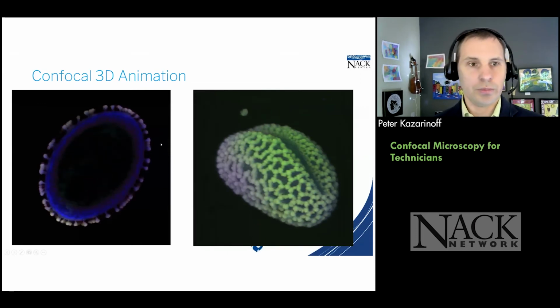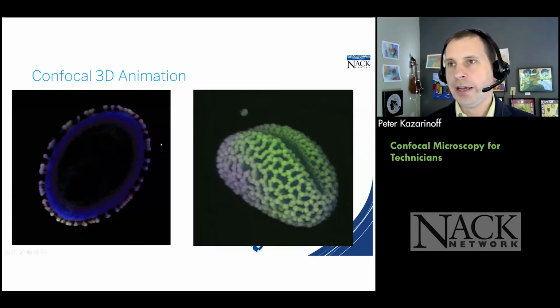Do you also have a temperature stage, and you can change the temperature when you're looking at the images? Yeah, in our Olympus microscope, we could also change the temperature of the stage and manage that. And we could also put many different types of samples in the stage as well. What we weren't able to ever do is image frozen samples, but within the regular range, a couple degrees C to higher than room temperature, we could vary the temperature of the samples.